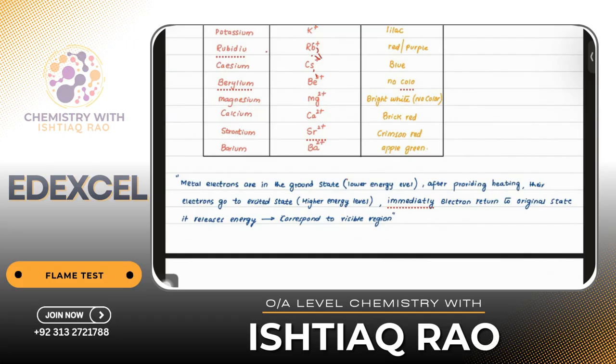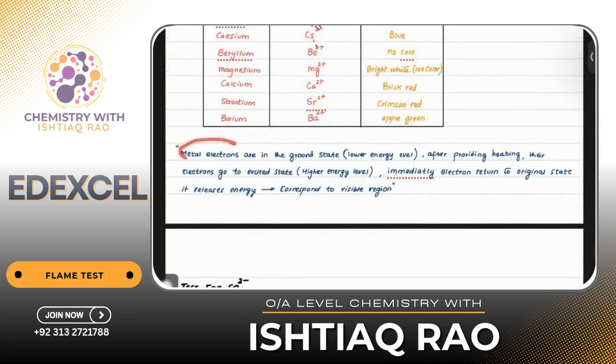Number one, metal electrons are in a ground state at the lower energy level when we have not provided any temperature or flame.